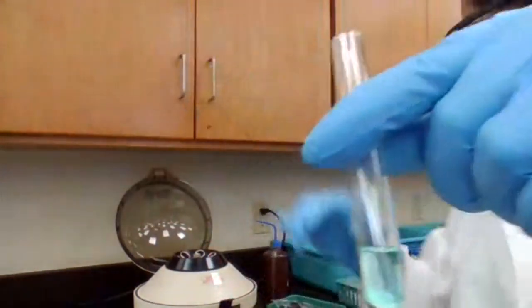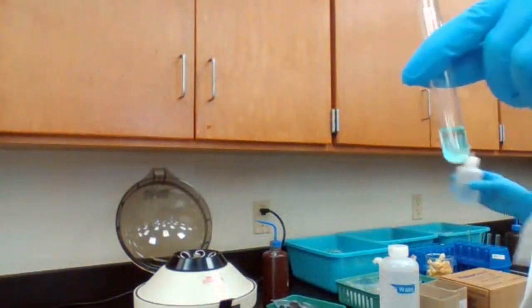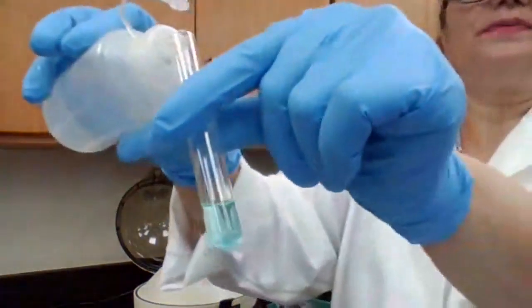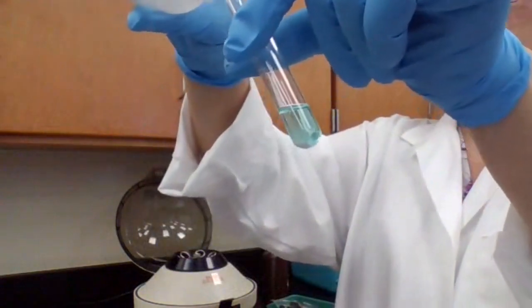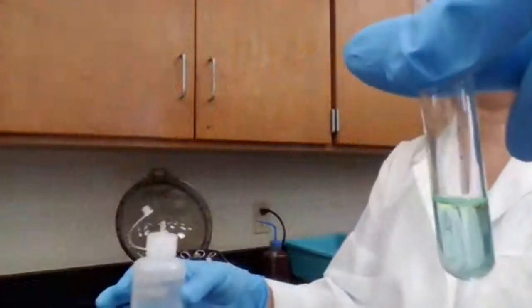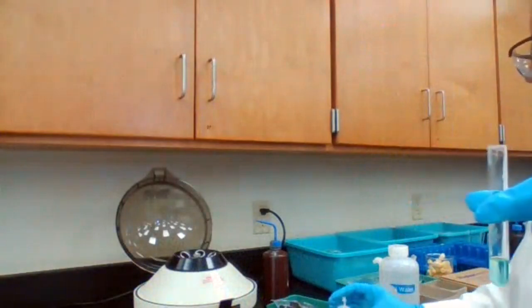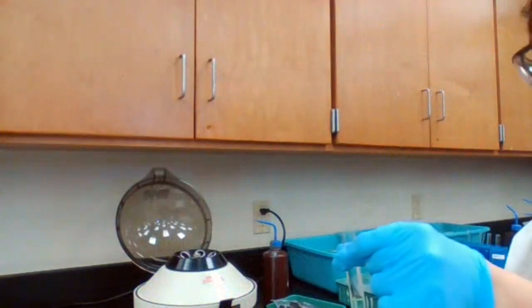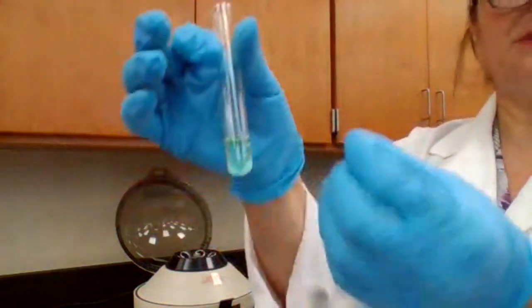Without disturbing it, the next step says add additional drops of the HCl and see if new precipitate is forming. Okay, I add 2 extra drops and no new precipitate forms. So this means that all of the silver and lead already precipitated.